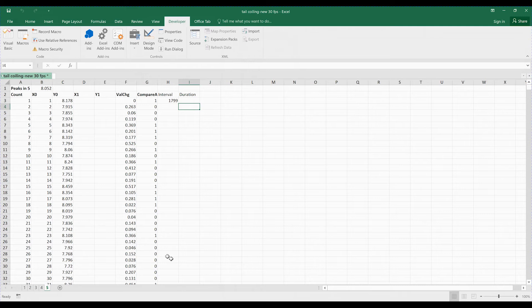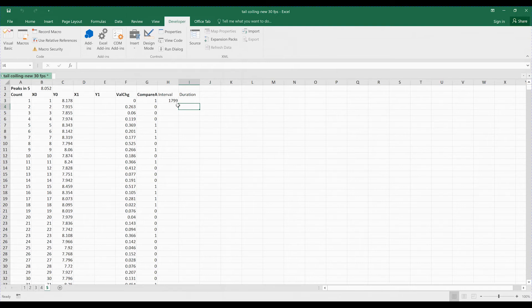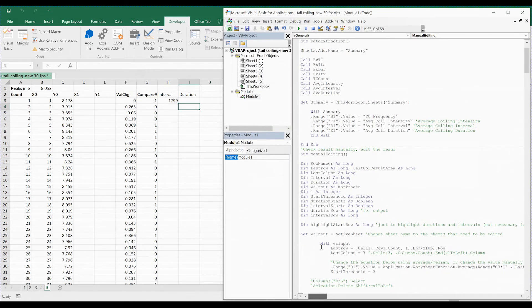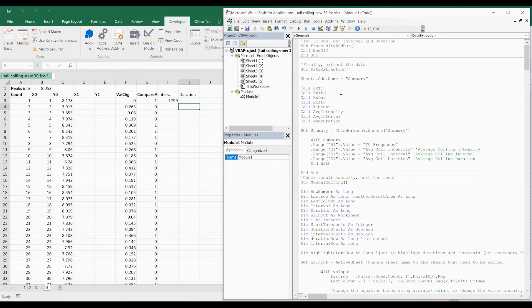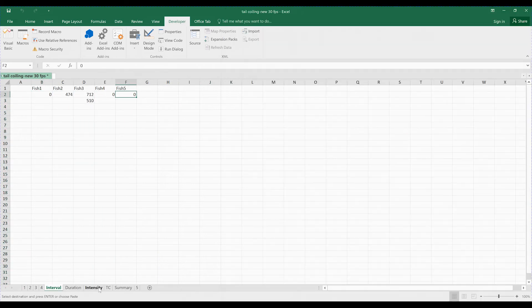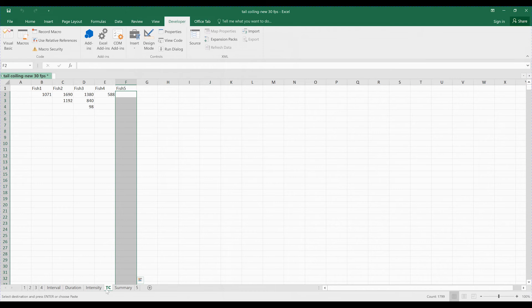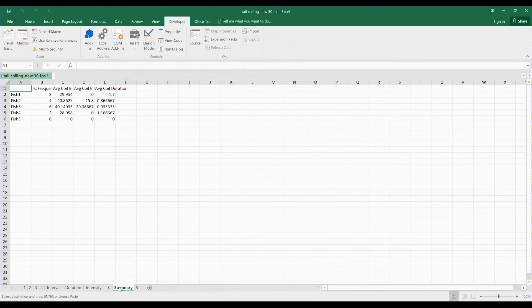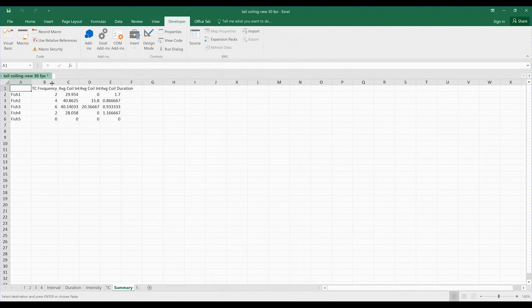The next sheet has no egg movement, so the interval is the full length of the video — it will be emptied in the end. You don't need to worry about this one. Next, I will run Data Extraction to create the summary — click on this area and press F5. Now we will have several new sheets: Interval, Duration, Intensity, TC (showing when tail coiling happened), and the Summary.